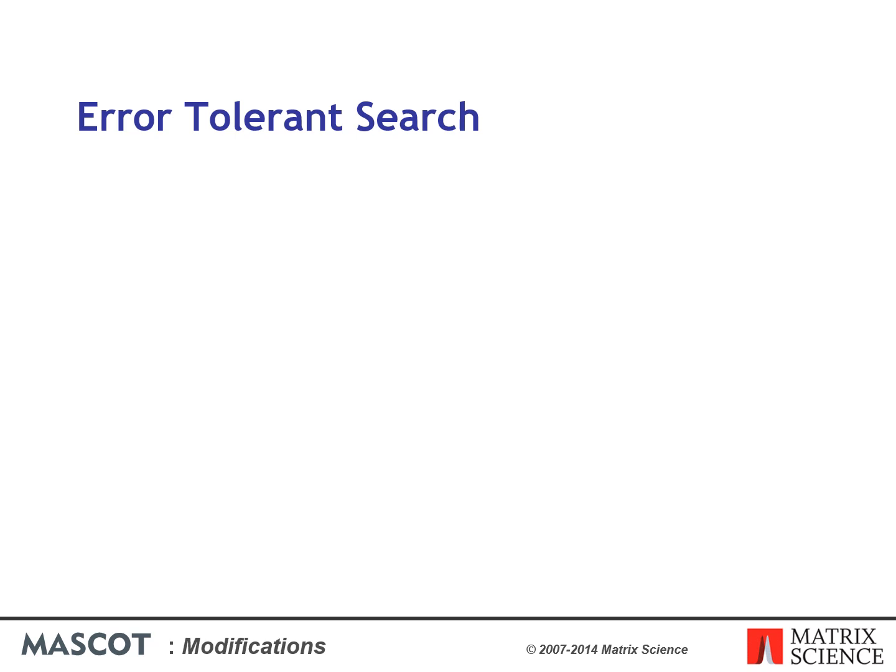Now, back to the challenge of finding post-translational modifications. There are many hundreds of modifications in Unimod, yet I've emphasized the importance of using the minimum number of variable modifications in a search. So, how are we supposed to find unusual modifications? If you are searching uninterpreted MSMS data, the efficient way to find unusual modifications, as well as variations in the primary sequence, is a two-pass search.